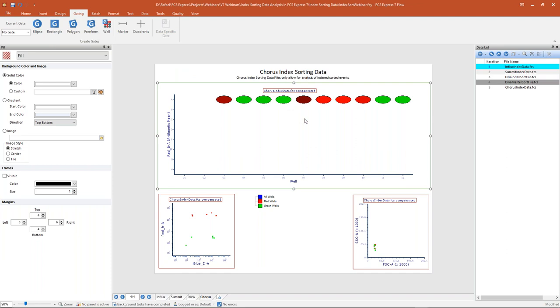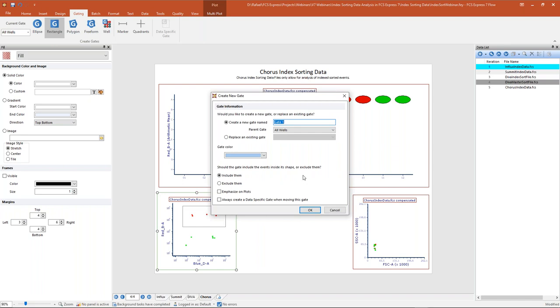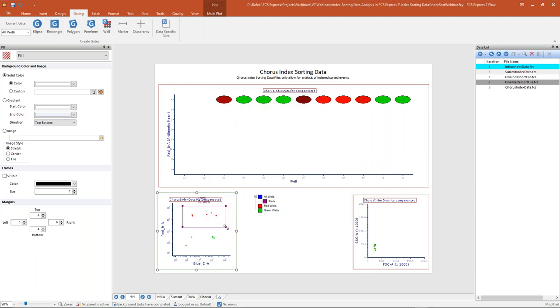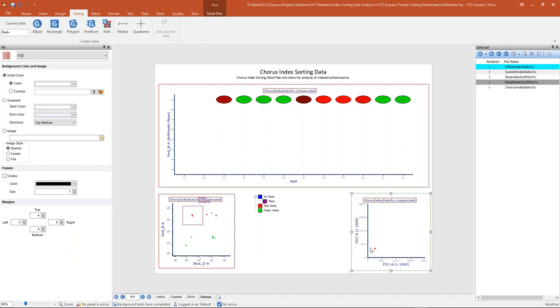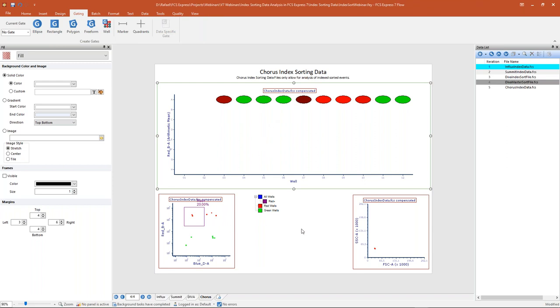In addition to gating on heat maps with index sort data, we can also simply create gates on our regular plots, just like any normal analysis. I could create a rectangular gate and capture all of my red wells, calling this 'red positive,' making it a violet color, emphasizing on my plots. This is a regular gate that I can apply to my other plots for further analysis. As I move this gate, we can focus in on different populations. The take-home point is that heat maps and well gates function and interact with any other plot in the same way you're used to in FCS Express — so any gating hierarchy or strategy is still applicable to what you're doing with your index sorting data.